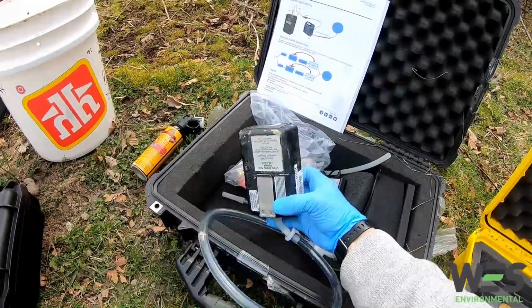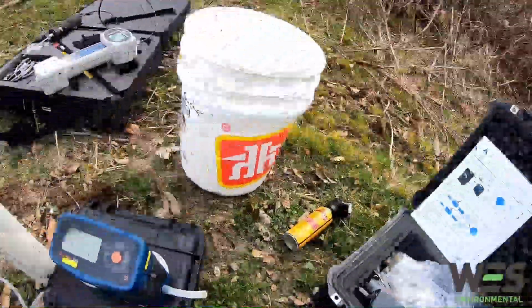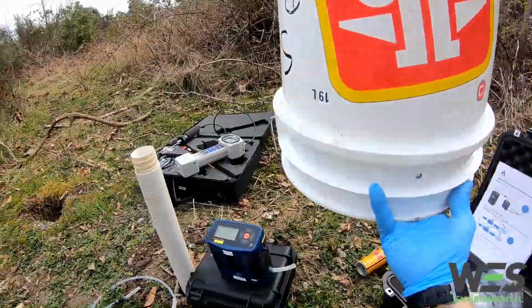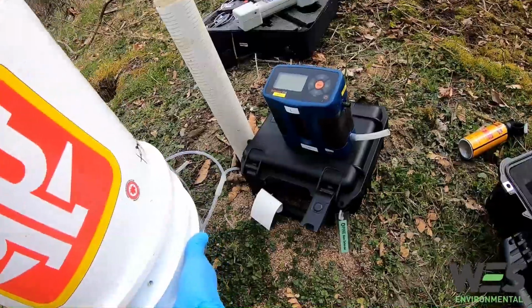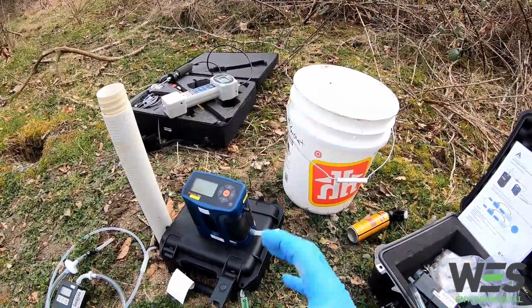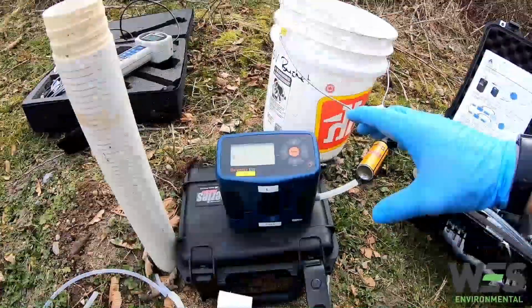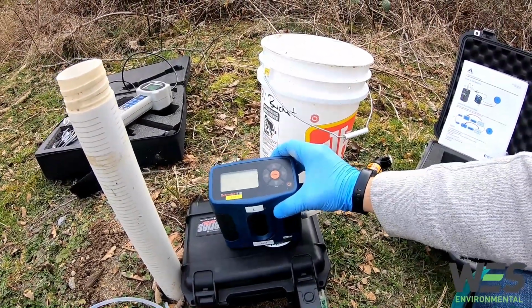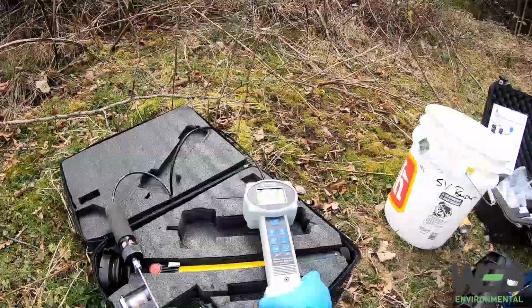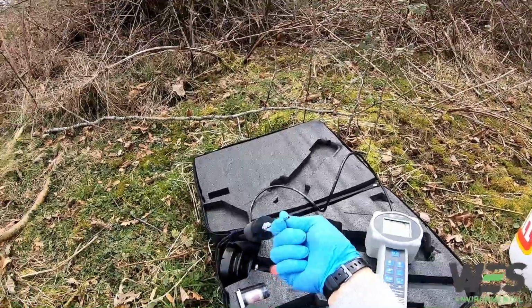I've got the pump, got my TD tubes which actually collect the sample, and then I've got my bucket. This we use to put over the soil vapor tubing to create this relatively airtight area, which goes into the whole helium testing thing, which I'll be showing you later. I've got the dry cal. This is what we use to measure how much air is actually being pumped out of this tubing. And then this is the helium measurement tool. It measures how much helium is being sucked in through this guy here.